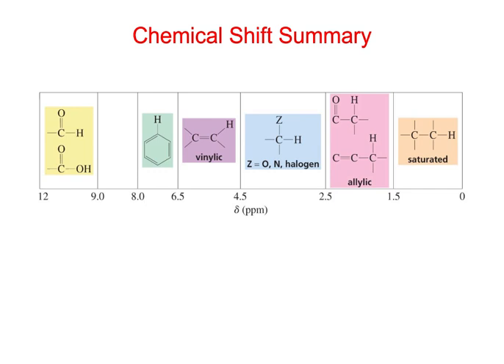So here's just some general ranges. In fact, I always say that you can do maybe 80% of the spectroscopy problems just by knowing some general ranges of chemical shift, and then if you have some that don't fit, or they aren't simple like this, then you can do something more.